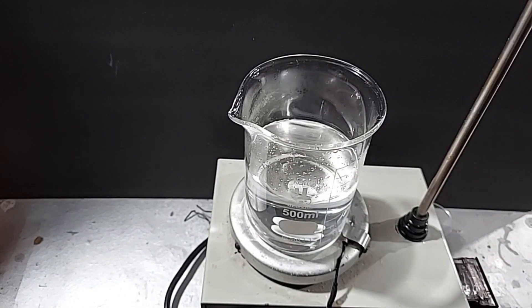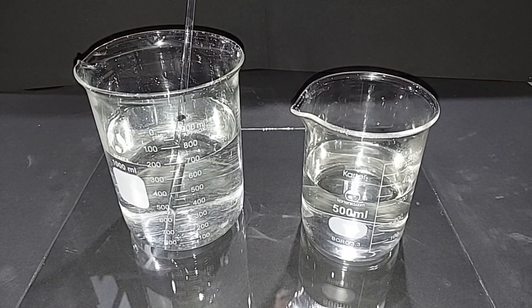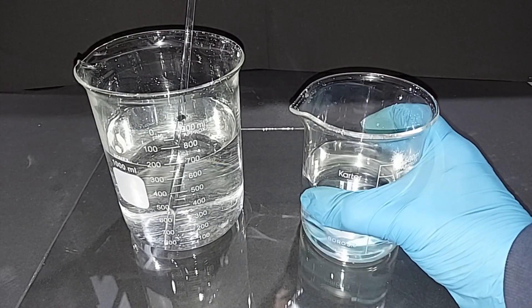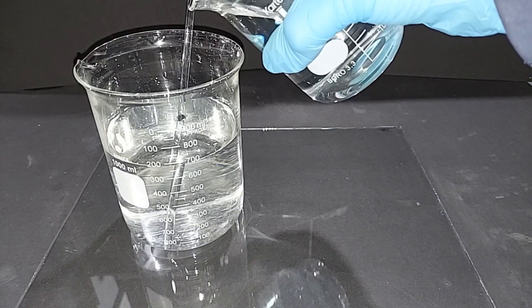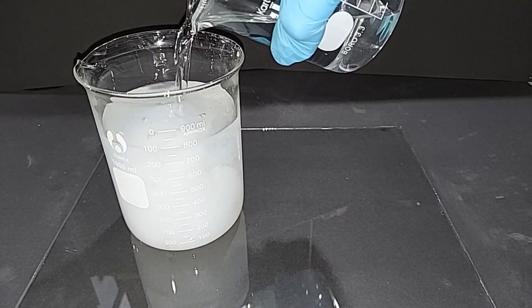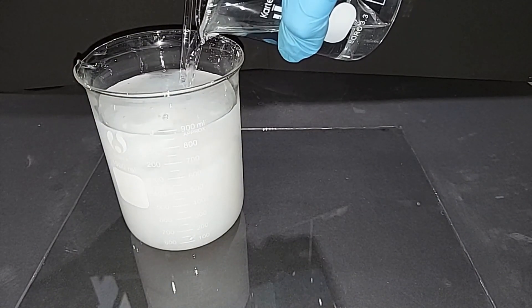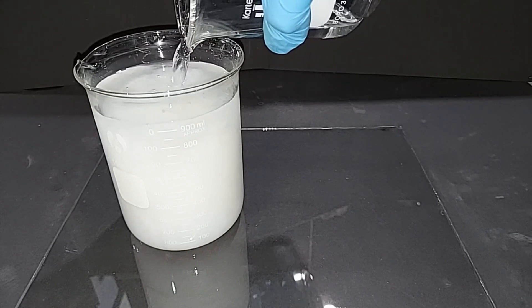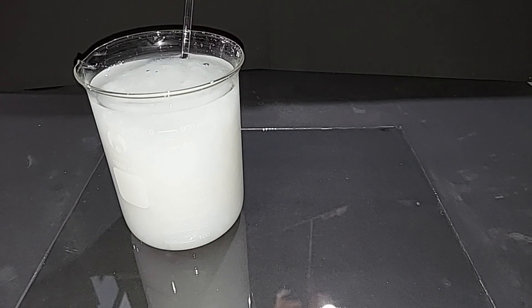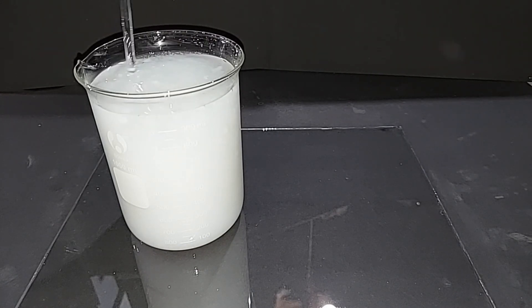Moving it over to where we'll do the experiment — in this rather simple experiment, this is where the magic occurs. I'm going to pour the sodium carbonate into the magnesium sulfate, which will produce our magnesium carbonate. You can see it come out of solution right away as a milky white substance. The excess magnesium sulfate and the sodium sulfate produced will stay in solution since they're both very soluble in water. When we filter, they'll flow through and we'll be left with just the magnesium carbonate.